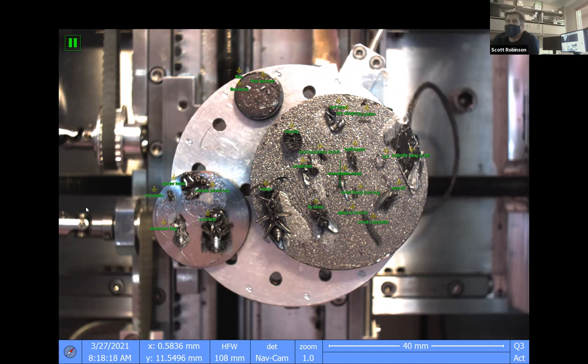So from March 1999 up to October 2015, about 16 years, we ran this one version of Bugscope, and we did about 1,000 sessions with people all over the world. Classrooms were able to control an electron microscope from their desks, or the teacher would help them anywhere in the world. So we connected with some people in Tanzania, in Australia, in Korea, all over the world, but most of the people were in the U.S.